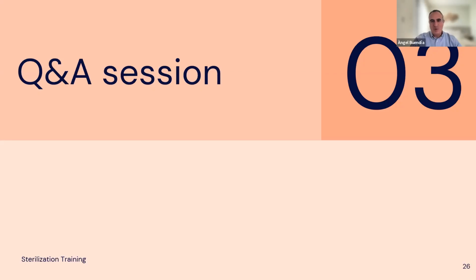Okay, let's go to the Annex 1. Can you give us some highlights or a brief understanding about the sterilization concept that is covered by the Annex 1 of GMP? That's a good question, because in the current company, we're also looking into the update of the Annex 1 that was done 1 or 2 years ago, but now it's becoming effective. Some other things are a little bit changed in wording and expectations. The Annex 1 is more based now on risk-based analysis and monitoring plans.